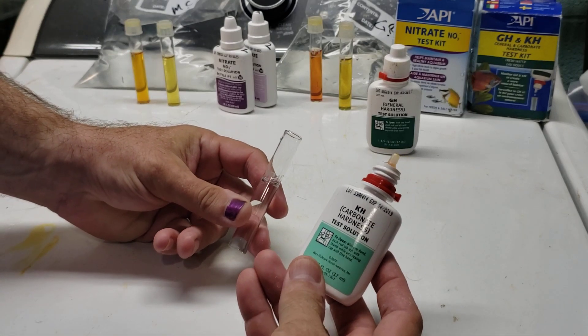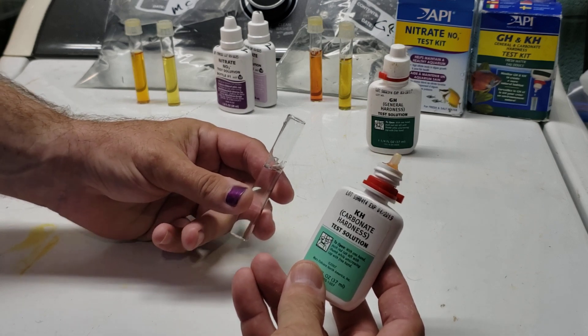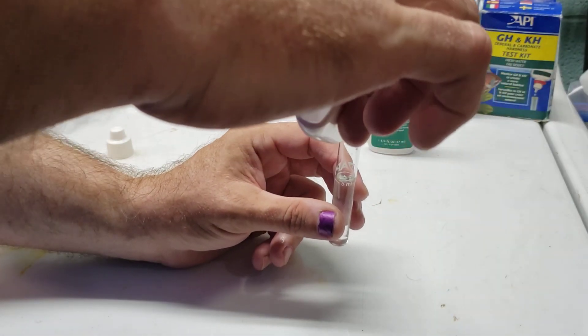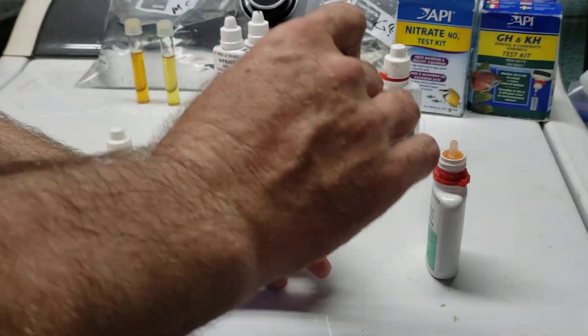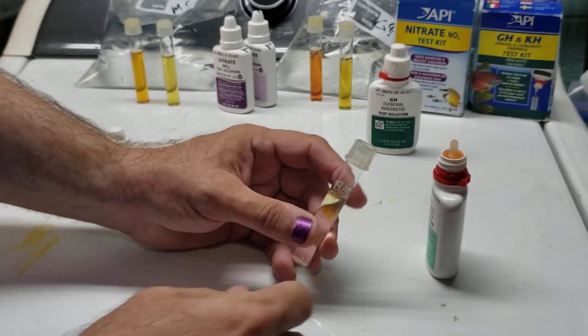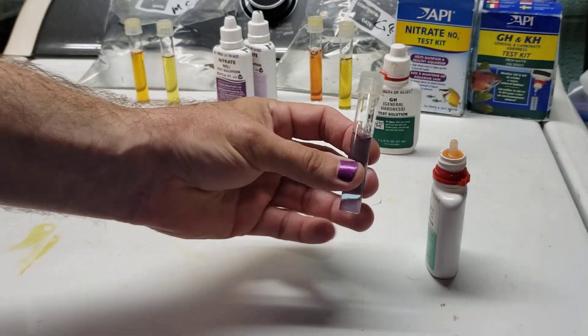The first thing you're going to do is take your bottle, get it open — no shaking, no big fuss, nothing to worry about. Once it's open, you're going to put one drop in, and then put your plastic cap back on, invert it a couple times. You see how it changes to that blue color.